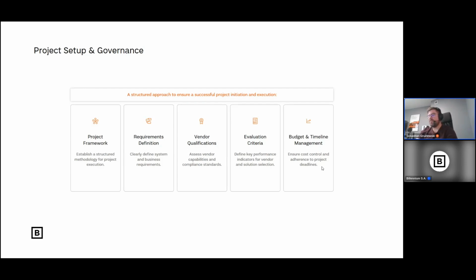So it's really good to think about what interfaces you want to incorporate. For example, an interface for a LIMS system or a chromatography system is essential for the success of such a system, because of the benefit that lab people are gaining, because they don't have to do the manual work of writing results from one page to another.